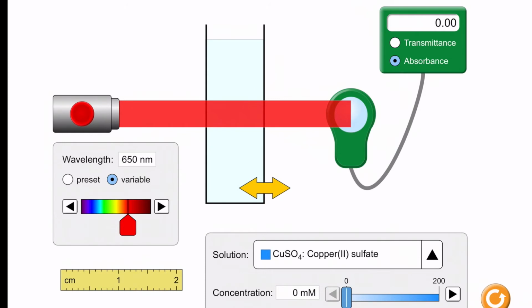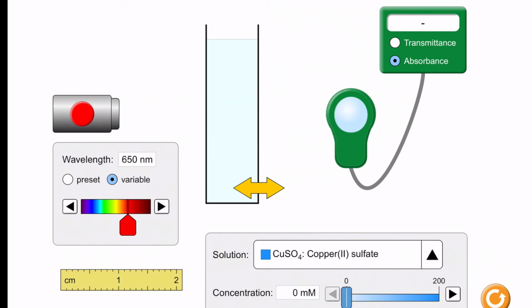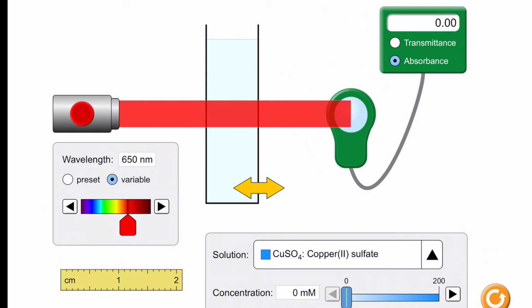So a colorimeter measures how much light can pass through a sample. And the amount of light that can pass through a sample is proportional to the concentration of the sample. So here I have a simulation of how the colorimeter works. And I've got the cuvette here in the middle. You can make different sizes, so make it 1 centimeter. We've got a light that passes through. This is what happens when you turn the colorimeter on. Light shines through the sample.